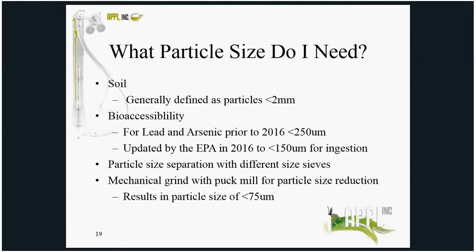Samples are typically air dried before sieving for the non-volatile contaminants. Some semi-volatile contaminants may be prone to loss if air dried before sieving and subsampling if the source is a fresh one. Therefore, samples for certain semi-volatile contaminants may need to be wet sieved or analyzed wet without drying or sieving, and these measures need to be considered when looking at how to process your sample.